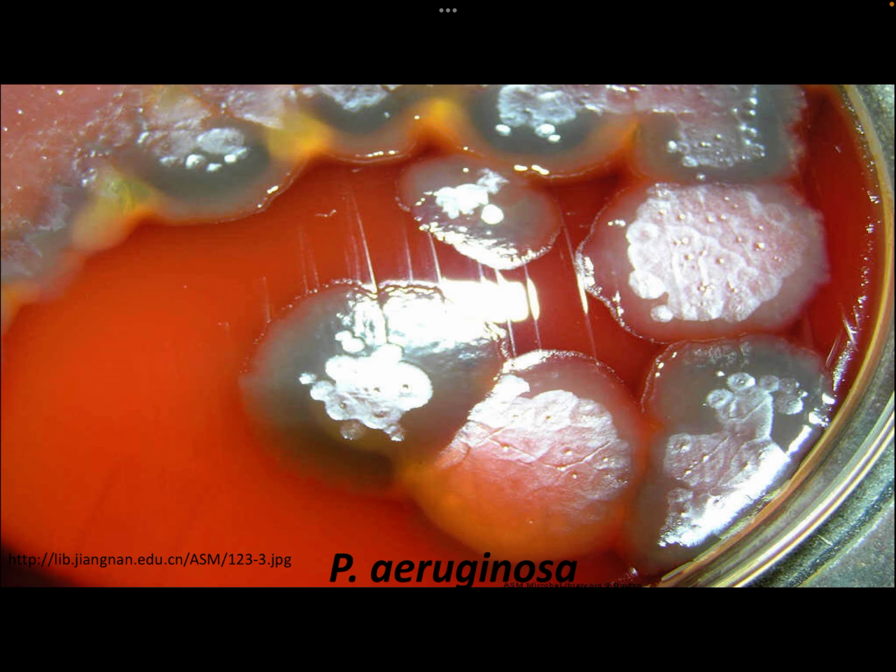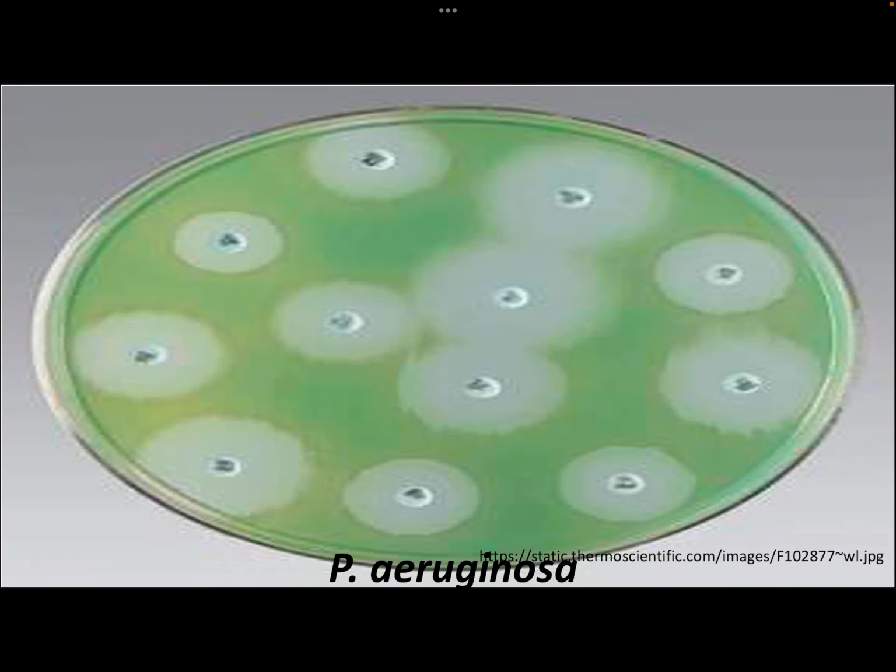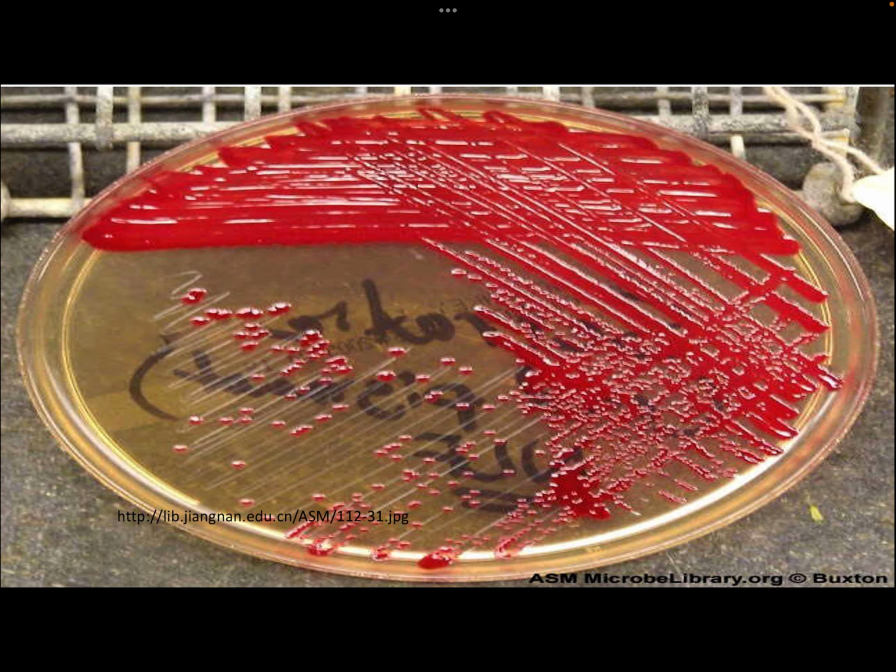And when you slightly open the plate, you can observe that there is a fruity odor coming from the culture of Pseudomonas aeruginosa. That's very, very distinct. You will get used to the smell if you are always culturing Pseudomonas aeruginosa. Another thing, this is again pigment production of Pseudomonas aeruginosa in Mueller-Hinton. Color green. Serratia marcescens, very distinct at room temperature again.